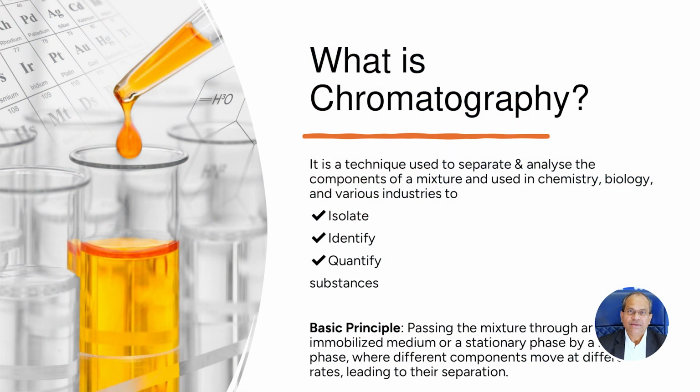Continuing with our Masterclass series, today I will touch upon liquid chromatography grade solvents, or different grades of solvents used in various liquid chromatography applications. Let us get started. Just a recap, as you all know, chromatography is a technique used to separate and analyze components of a mixture and used in chemistry, biology and various industries to isolate, identify and quantify substances.